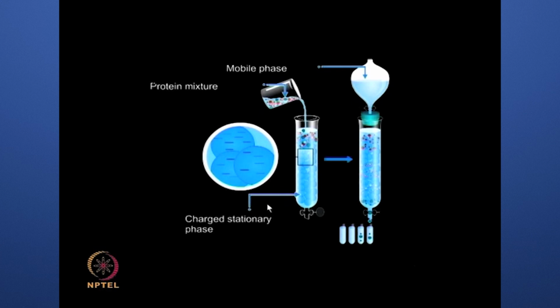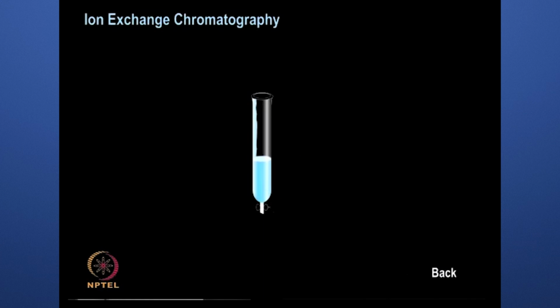as different sample fractions. The solution leaving the column can be collected in suitably sized fractions for further analysis. After giving you a brief description of the components, let me show you the process in animation.